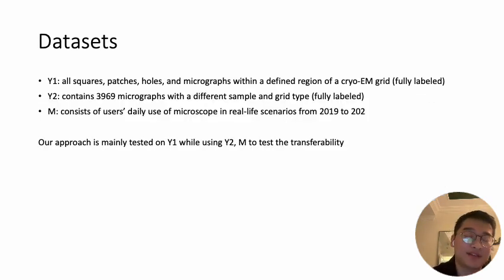We mainly evaluate our proposed approach on 3 different datasets. The Y1 dataset is a simulated dataset where all the squares, patches, holes, and micrographs are observed and evaluated within a defined region of a cryo-EM grid.